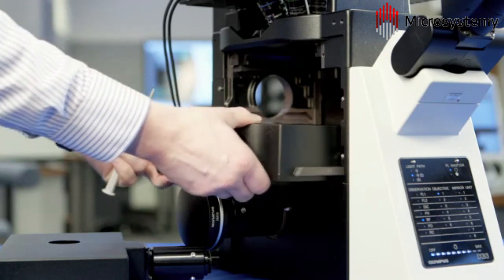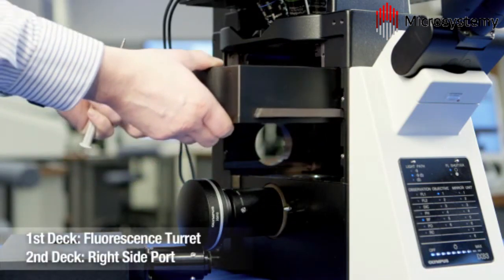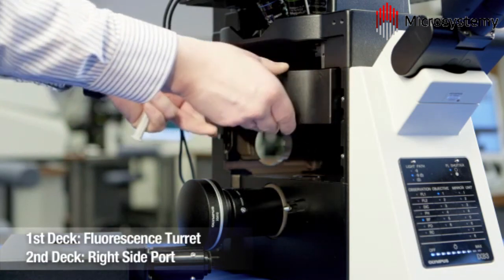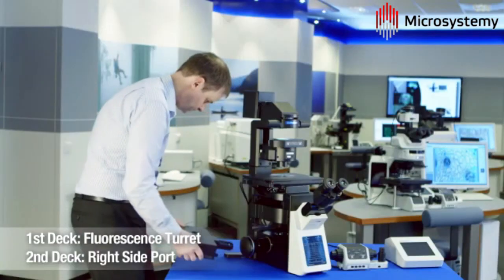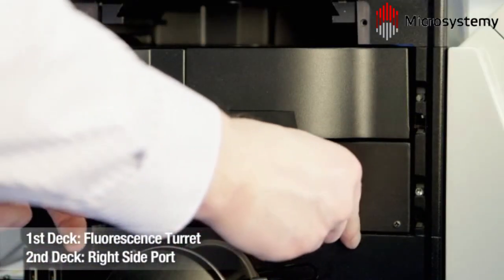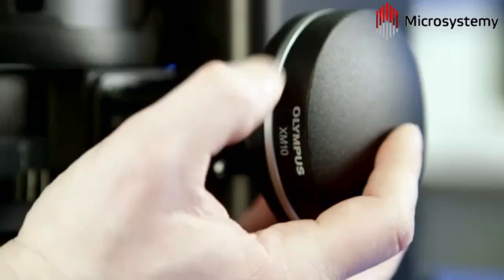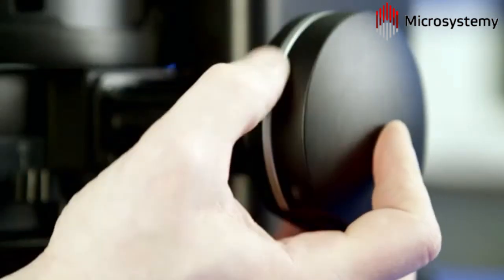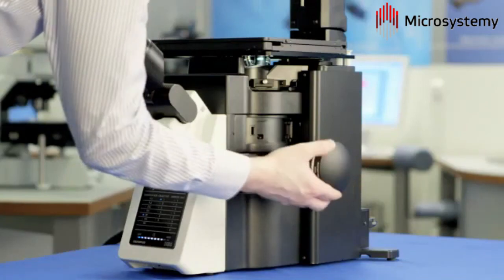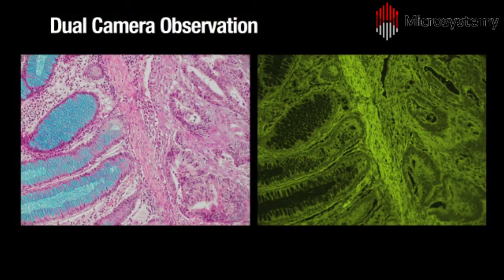Building upon these setups, the Olympus IX3 system can be easily adapted for dual-camera use. The filter turret can be combined with an additional camera via the right-side port module with a C-mount. This is ideally suited to the analysis of pathology sections, which exhibit different features when visualized with color or fluorescence. An example of dual-camera use can be seen with this colon carcinoma section, imaged using both a color camera and a monochrome camera.